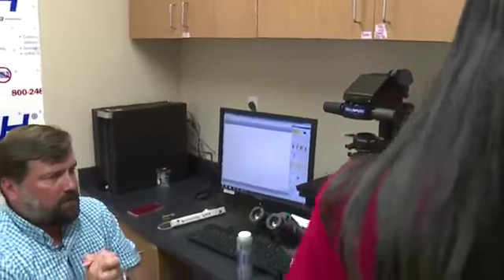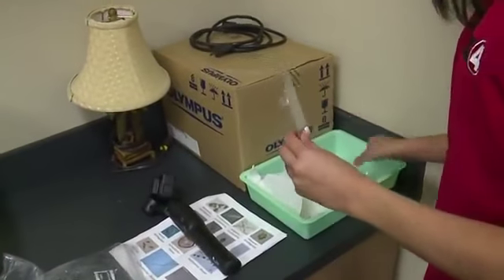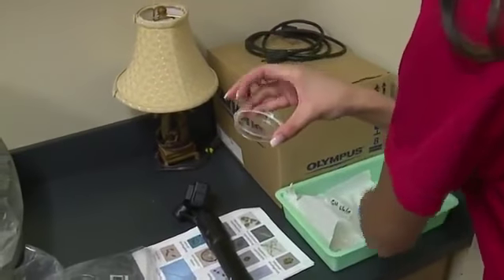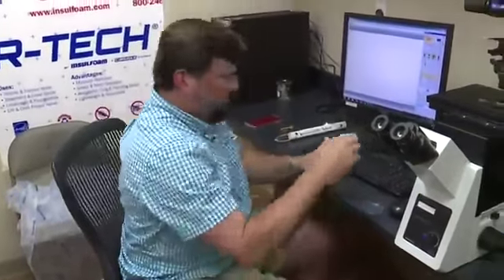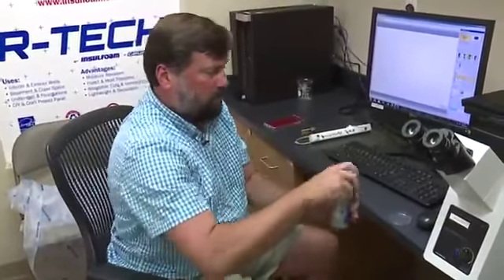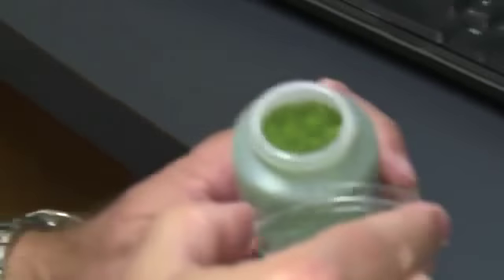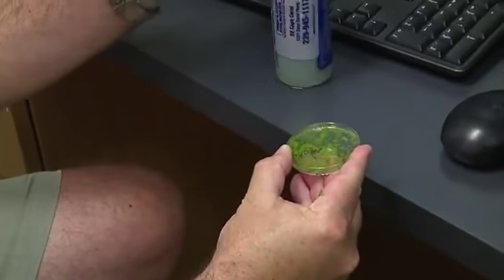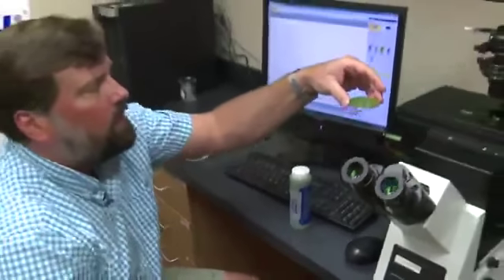So I think the first thing to do would be, in that green tray over there, I don't know if you see a little slide, or there are some little chamber slides. Maybe smaller, like these. Yeah, we can use one of those. Which one do you want? The left-hand one. So we won't be too scientific on this. We'll just pour some in here. We're just looking. We're not really quantifying. We're not trying to see how many algal cells there are per unit area. We're just trying to see what is in here.